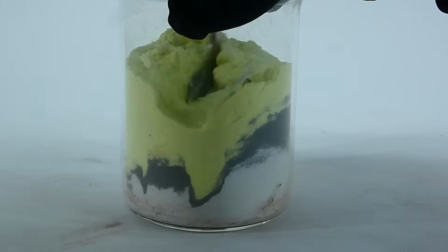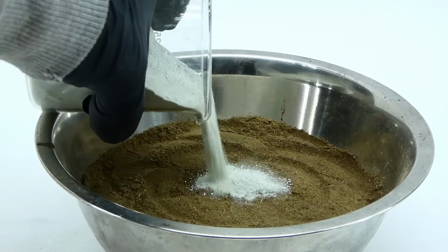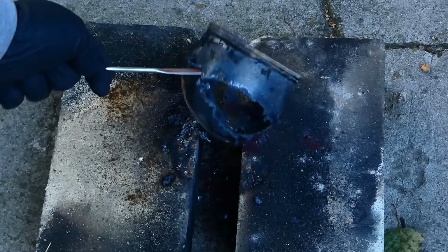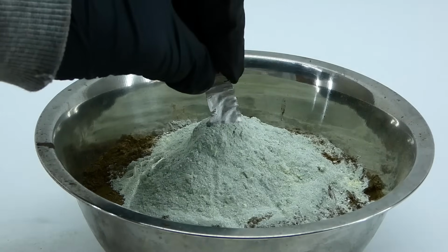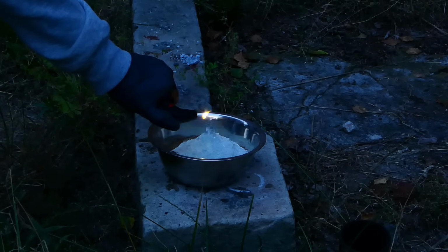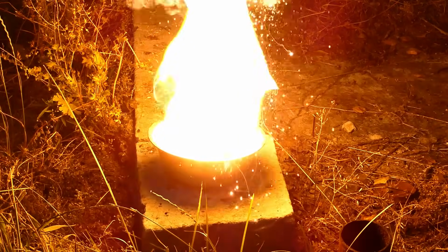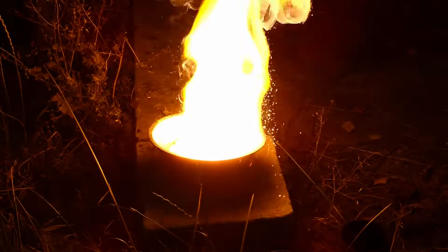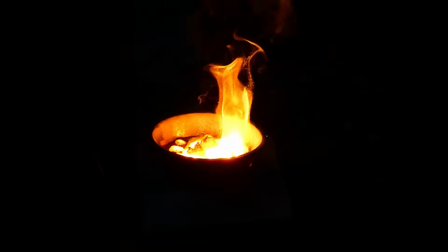I then mixed all of the ingredients thoroughly and put them into a bowl with some sand to prevent it from being disintegrated like that can earlier. I then put a magnesium shaving into the mix and ignited it. It burned very brightly and vigorously, and when I thought that it stopped, it started to burn again.